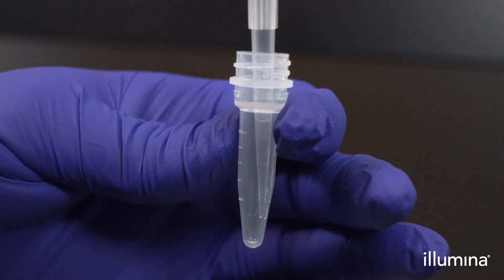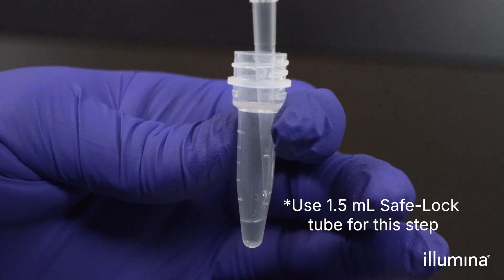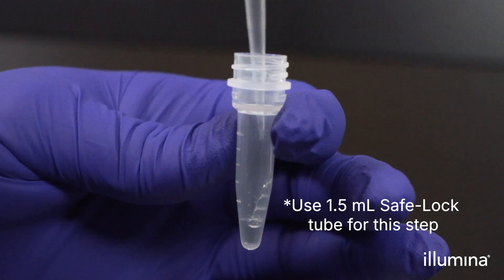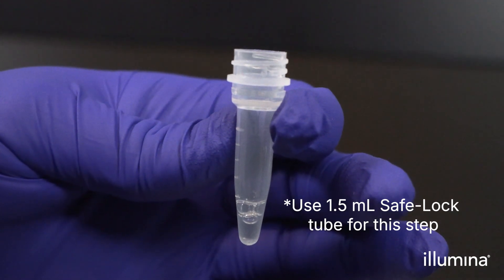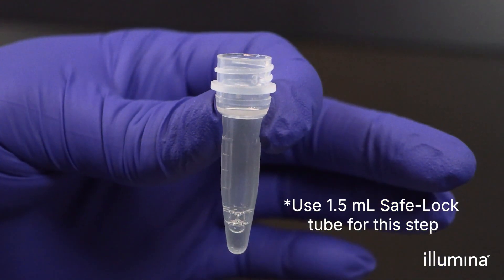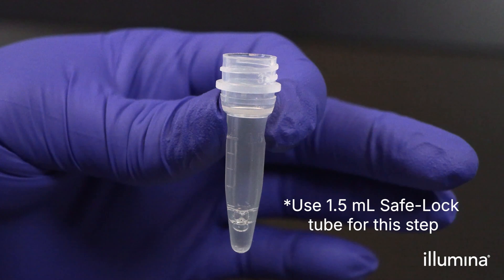Aliquot 40 microliters of CLB3 into the tubes for each sample being processed. For the remaining chemical lysis steps, we recommend processing one sample at a time.